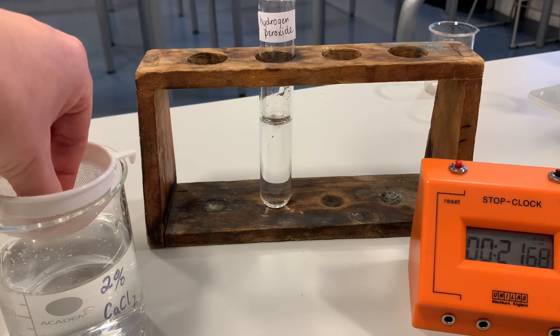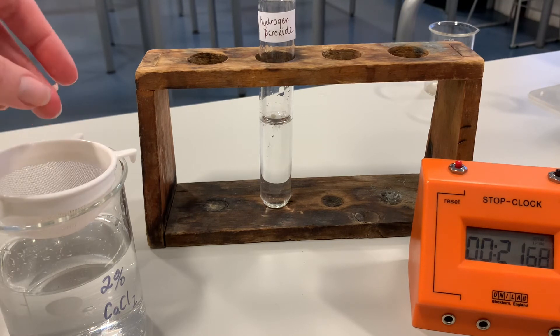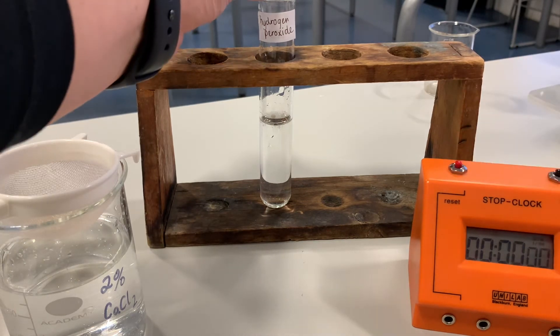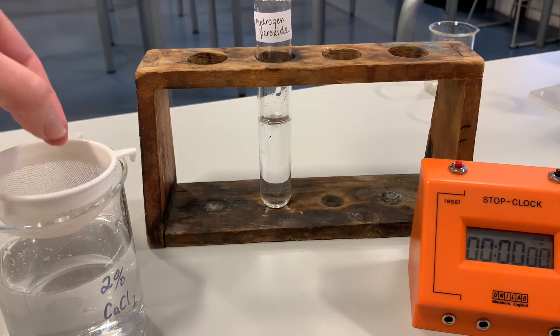Remember when you're doing experiments you always repeat them to make your results reliable, to show that the same thing happens over and over again. So we'll pop another one in so that we can make sure our results are reliable and get similar times, which allows us to calculate an average when we have several results. We'll reset the stop clock and drop this one in so that it falls to the bottom. It's not wanting to fall to the bottom — we'll give it a wee gentle nudge. It's sitting right at the top, so I'll have to ignore that one. I'm trying to get another one to go right down to the bottom.